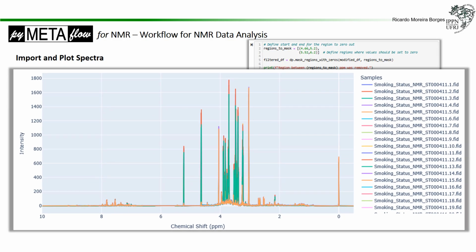So this is an example of the plot that we get. Later I'll show a demonstration, and I can zoom in and show you guys how to deal with it and how to download it. It's fairly easy.